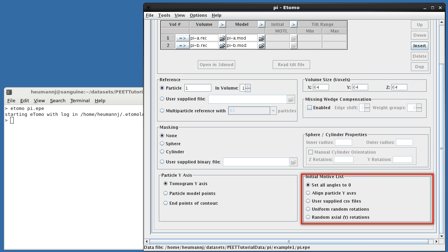PEAT stores alignments, that is, rotations and translations, for each particle in files called motive lists. We can use an initial motive list to specify starting orientations for each particle. In this case, no such information is available, so we've selected Set all angles to 0, which leaves the particles in their original orientation.